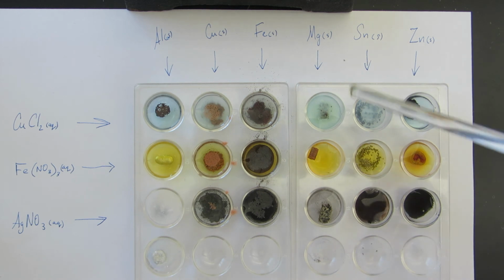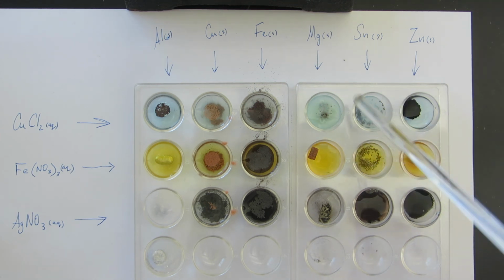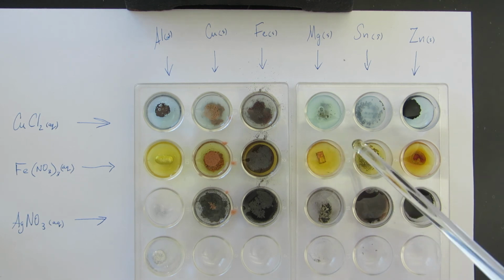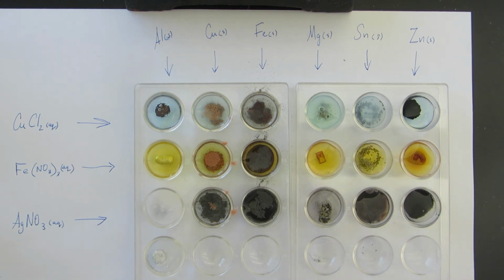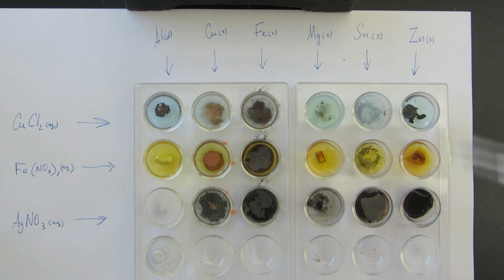Magnesium and copper. All right, you see some bubbling going on, and it looks other things. So something definitely happened there. And now we have magnesium reacting, it's bubbling. It's reacting with the iron, and same thing with silver. Okay. So all we're looking for is, hey, did a reaction take place? The zinc, we have a piece of zinc. It's definitely reacting with the copper. That would tell us that the zinc is more reactive than iron.